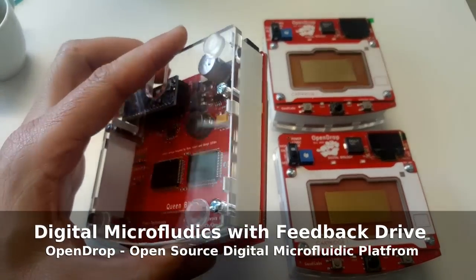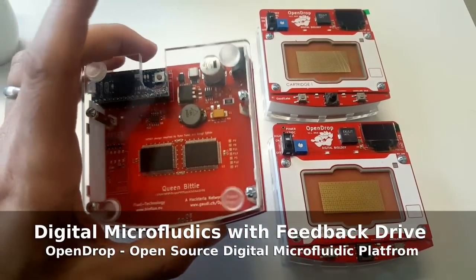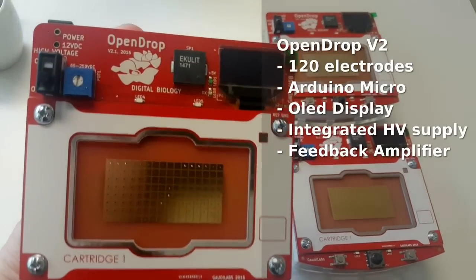Hi, this is Urs Gaudens from Gaudi Labs. In this video I want to give you an update on the OpenDrop Digital Microfluidics platform. I especially want to talk about the new feedback feature.